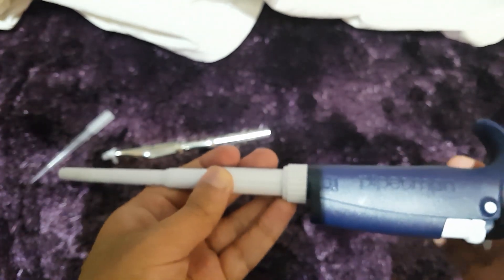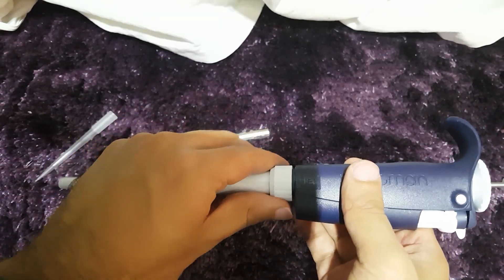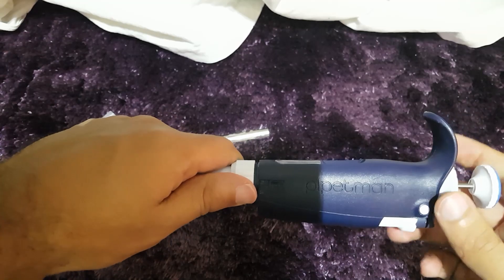Now we come to the main body of the pipette. This pipette works with springs inside, so the first thing you have to do is unscrew this part here.